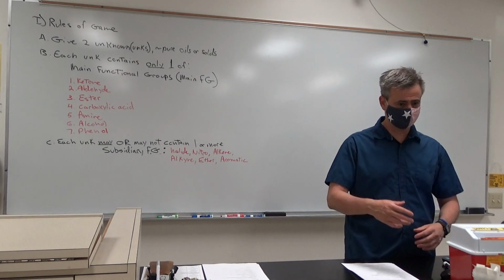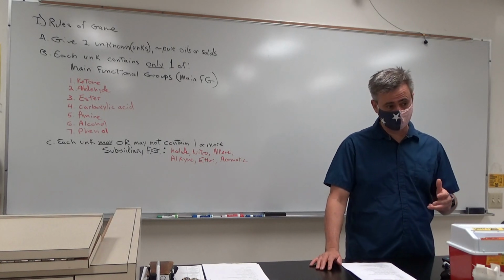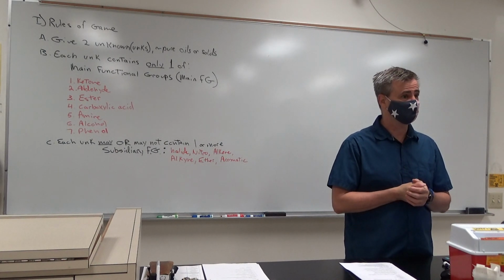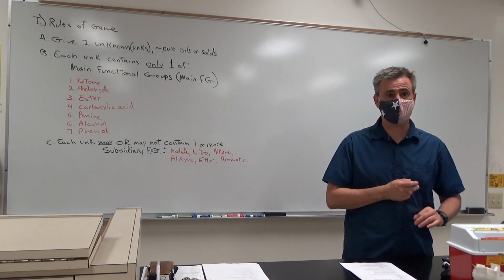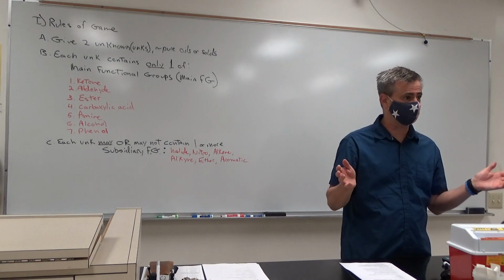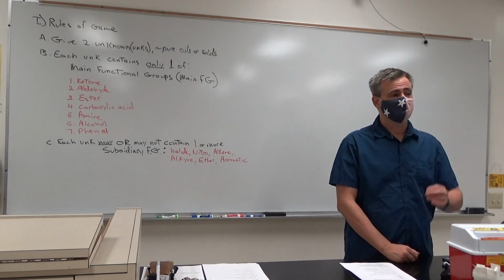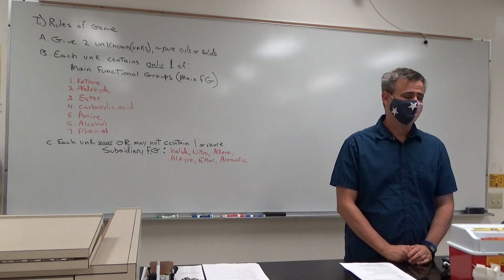It's written in here. I always like to shoot from the hip and then put this on the board. But the very first thing you're going to do after your physical tests is an aqueous solubility test. The aqueous solubility test is very important. I suggest that over the course of these weeks, you do it at least 3 times on each of them. They can really make or break you. Do it just the way it's described in the book, but don't change it too much.